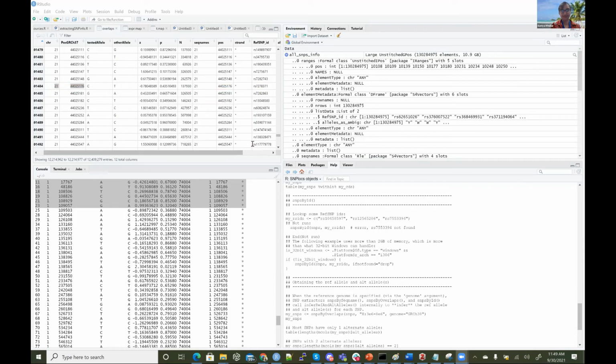I hope that you found this helpful and that this shows you how you can do the mapping, but please make sure you have a lot of space that you would need in your RStudio, and you've closed unnecessary files on your computer so that you can do this seamlessly. So I hope that this was helpful.